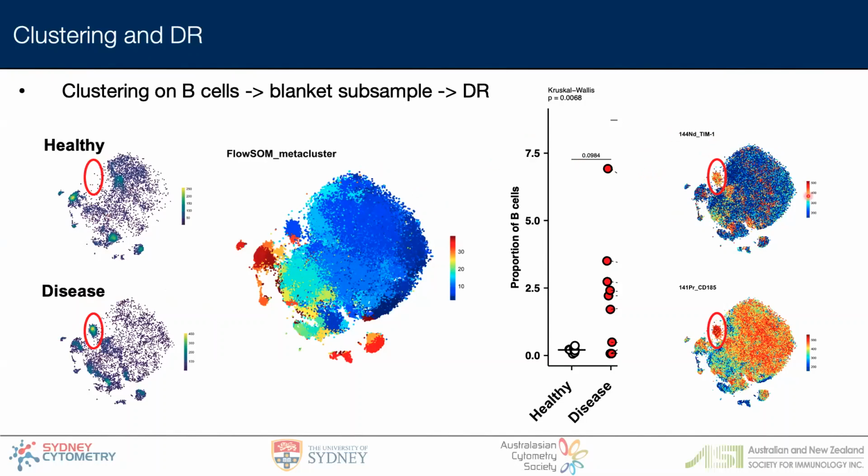You may want to still use your heat maps to visualize the heterogeneity across the subset, but you may not want to show these. And this is where, again, I think that manual gating is really the key aspect here, because that's what we're obviously all a lot more familiar with, and it really is still the gold standard. So it is always important to think about what the message is that you want to portray. And as I've said, there are multiple different reasons why things like tSNE, or even the clustering, can give you different results to what we may have found manually.